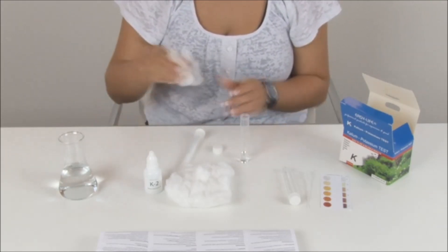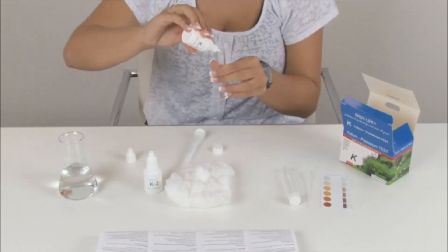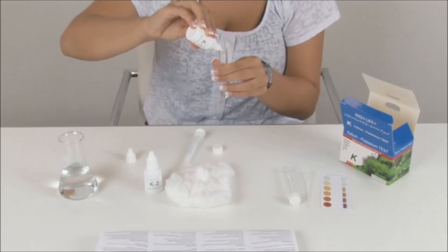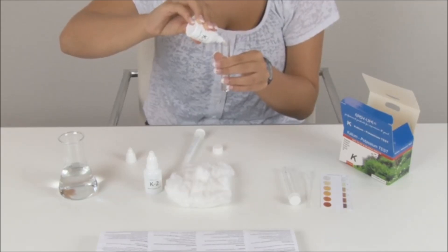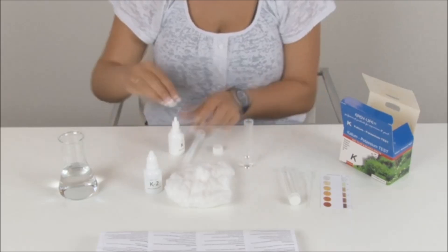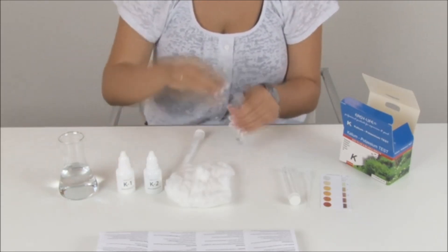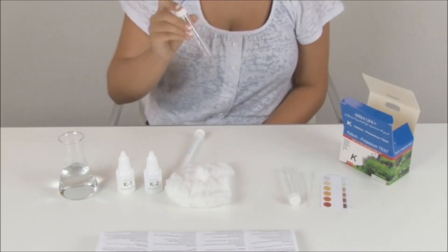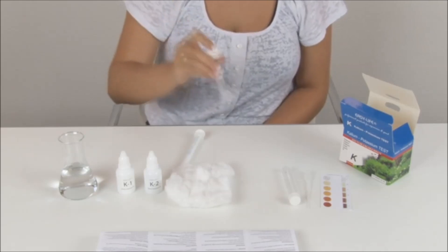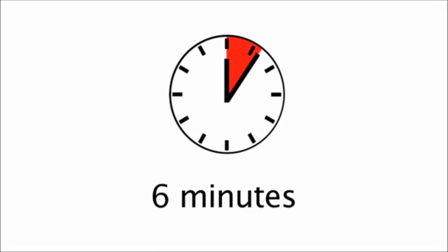Shake first, then add 10 drops of reagent K1 under a 45 degree angle. Cap the test tube and mix firmly for about 30 seconds. Wait for 6 minutes before proceeding.